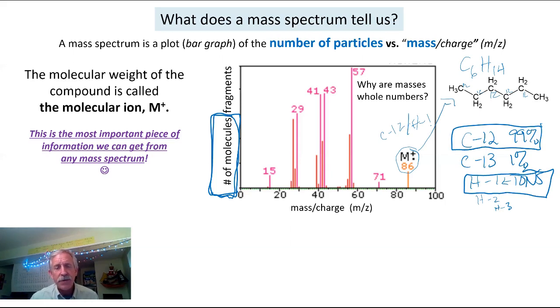Okay? Very, very cool. So it is a very sensitive instrument as well. And this is why Abby in NCIS loves to use it to detect even the trace small amount of blood or drug or compound in any mystery case. And this is why it's a very popular tool in forensic science. Okay, cool.